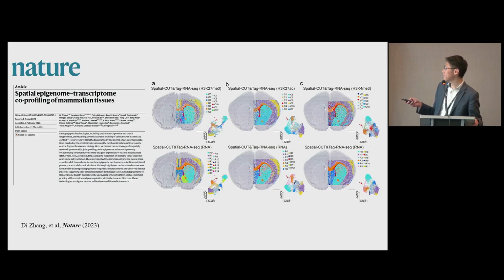And so you can get all the major tissue types. And now the question, I think one thing is, people also constantly ask, when you do spatial transcriptome, whether or not you need to replicate. My answer is often I don't want to do replicates, or that's not so necessary with large-scale, big omics data. Instead, if you have the budget to do multiple samples, I would say do multiple samples over different times, or set up biologically meaningful samples to look at. But still, if you can do replicates, you see highly consistent spatial patterns. That's still cool. In this experiment, we didn't do replicates, but from every sample we have the spatial transcriptome. This is kind of like replicates, and you see how consistent the different tissue features identified from all three different mouse brains.